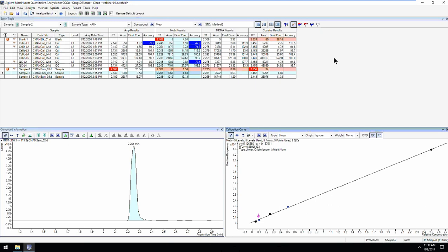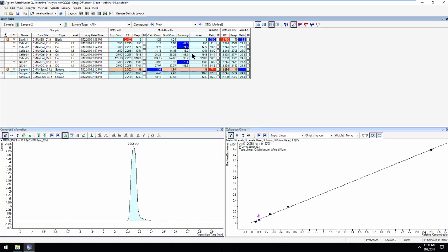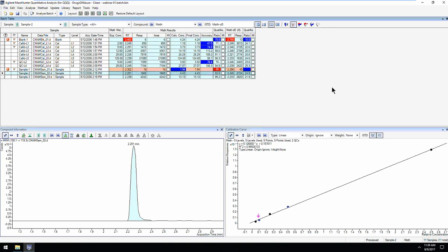Generally speaking, area is the integrated area that the integration algorithm found under the peak, and in most cases that will be synonymous with the response column in the batch table. So generally we just view one of those. Correlated response comes up, and I think we're going to address this again offline, Lindsay, because it is a little bit of a complicated answer. Yes, absolutely.